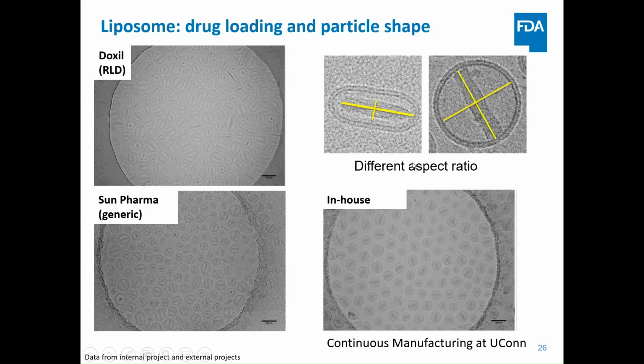So besides knowing whether a liposome is loaded with drug or not, we can do more with the AF4. For the Doxil formulation, a lot of the time, because of the presence of this spindle-shaped doxorubicin crystal inside the liposome, not all the liposome particles are perfectly spherical in shape. Some of them are elongated. So in that case, both their hydrodynamic size and RMS size may change.